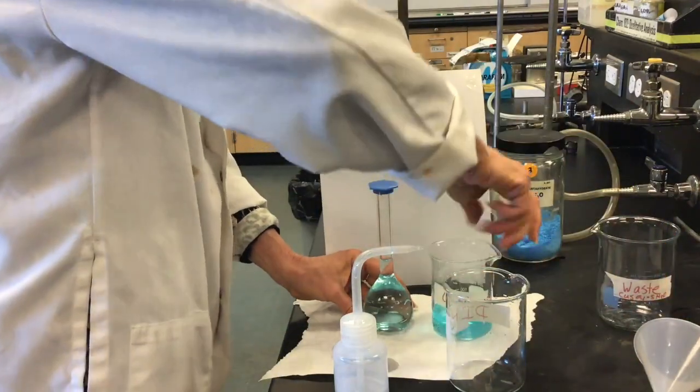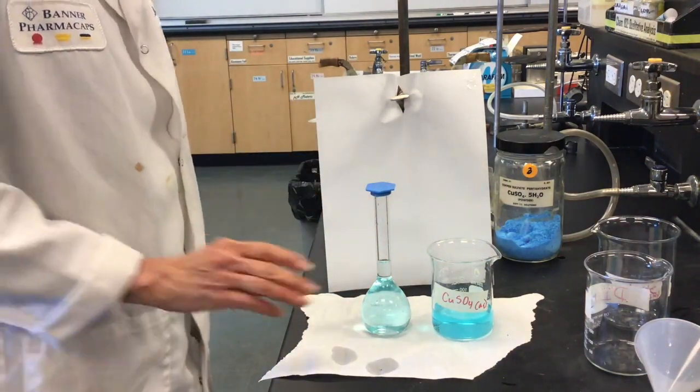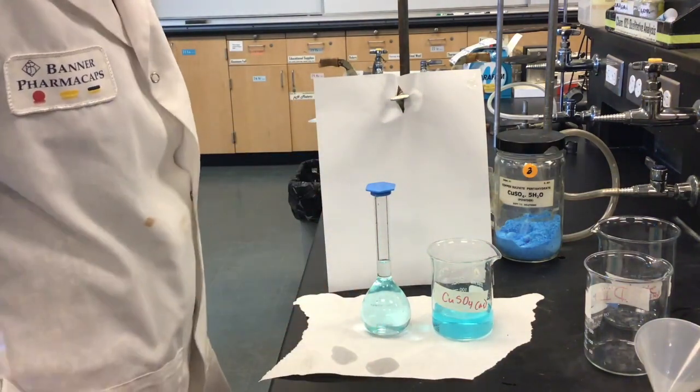solution. So we can compare the colors here of our concentrated and our dilute solution. So now you'll be calculating the molarity of the dilute solution you just made.